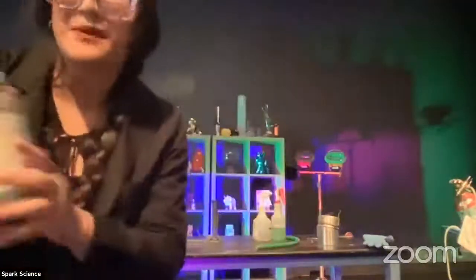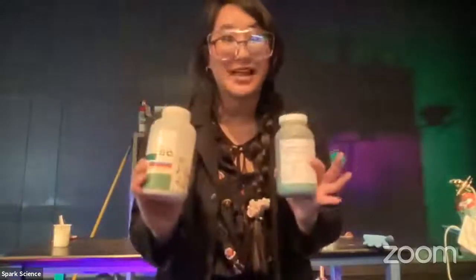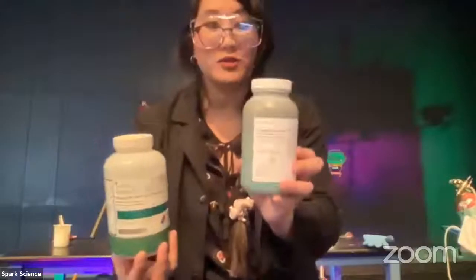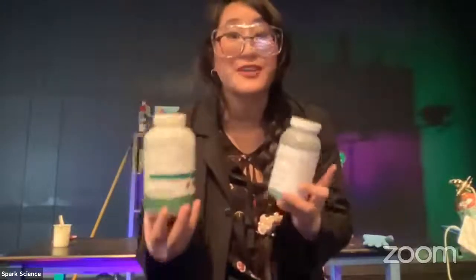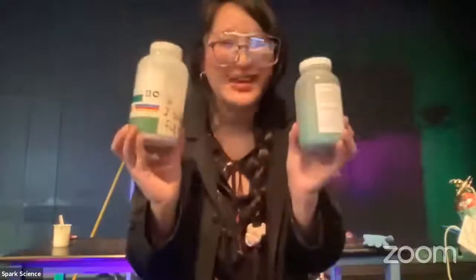I have something special to show you here today. We are going to be making many different types of flames, some even colorful flames. And this is what I'm going to use to show you some colorful flames. It's strontium chloride and copper chloride. These are metal salts. And one thing that I'd like you to know is that different metals burn different colors. If you ever wondered why fireworks burn blue or purple or pink or yellow, metal salts. Let me show you that here today.